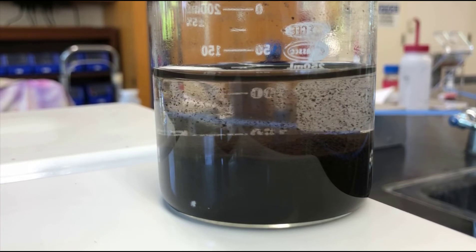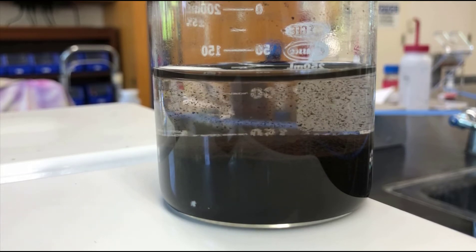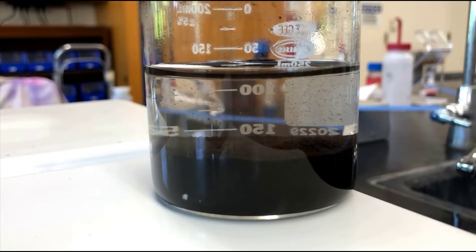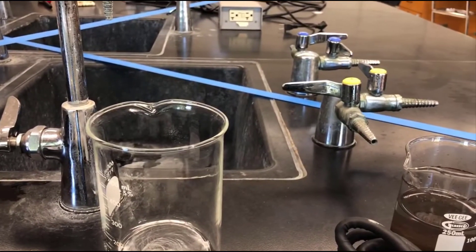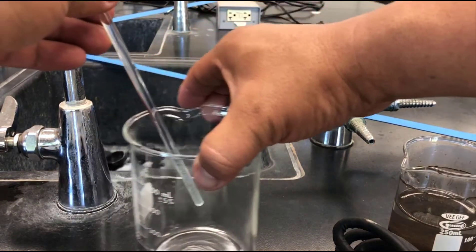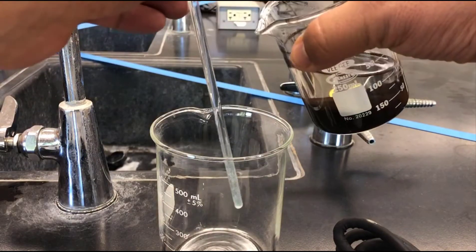In the end, what we should be left with is water and then the copper oxide product. I'm going to show you how to decant the liquid. This is kind of technique-based, so it requires two hands. I'm going to go ahead and try to do it around the camera. This is a waste beaker, and it's just one of those things that's useful to have around.